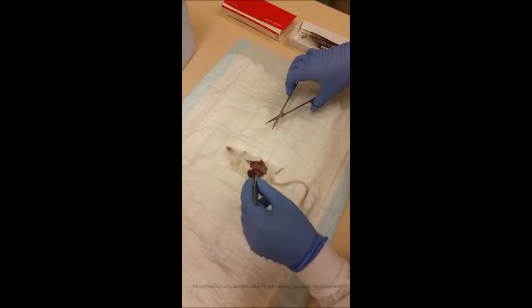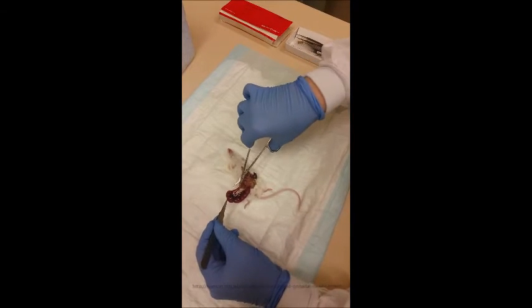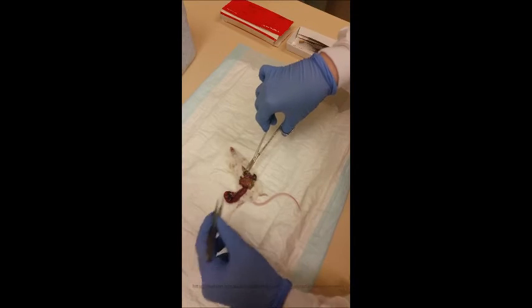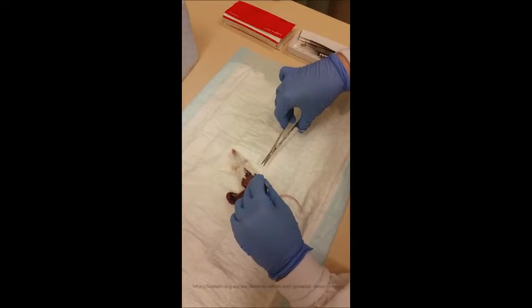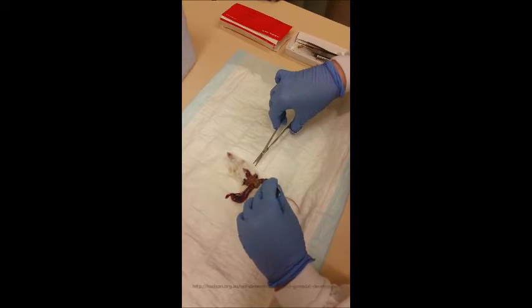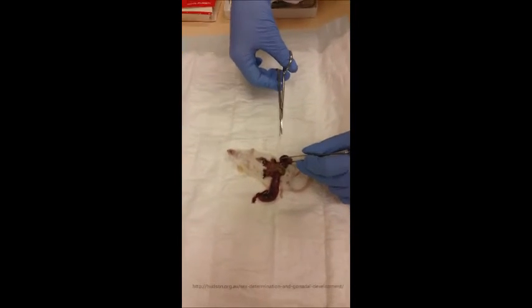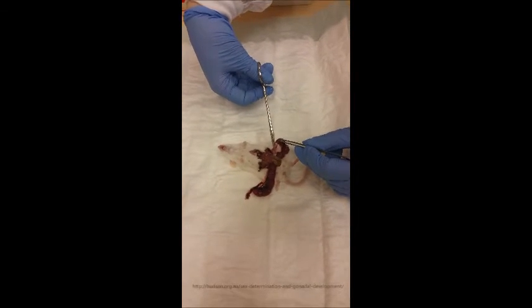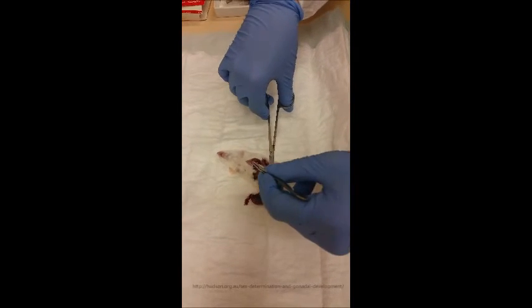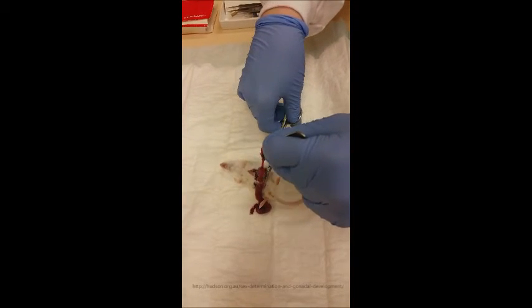The mouse has two uterine horns, so you can just pull on the embryos on one side and you'll see they're all attached together. Cut after the last embryo and do the same on the other side. Both uterine horns are attached together in the middle and attached to the body of the mouse.